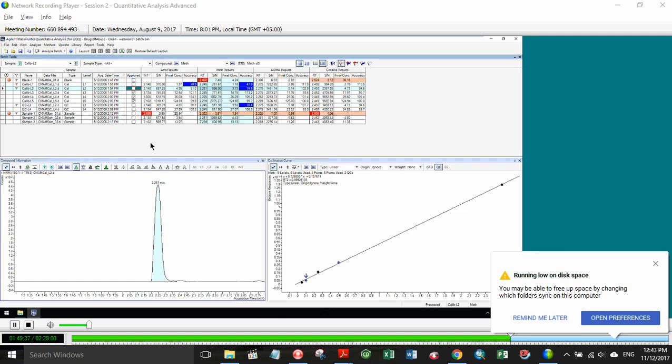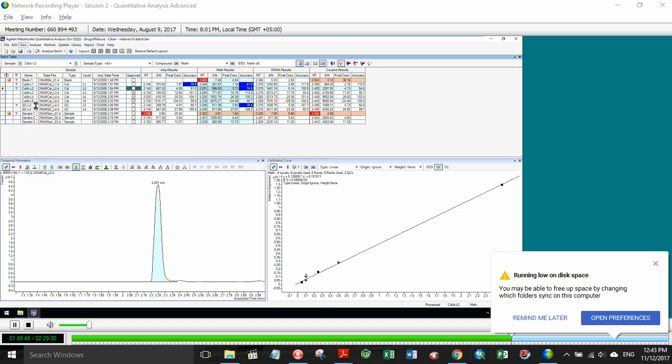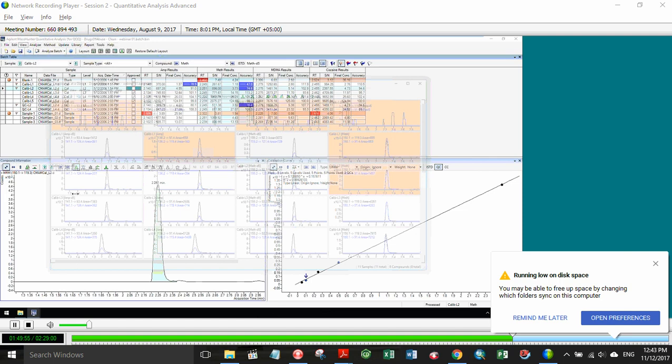Howard, there is a question here. I think you may have addressed this, but just to confirm, in compounds at a glance, if you set multiple types of outliers to be triggered, can you tell from the compounds at a glance screen which one was applicable to call it an outlier, or can you only see that on the batch table? Great question, I forgot to point this out.